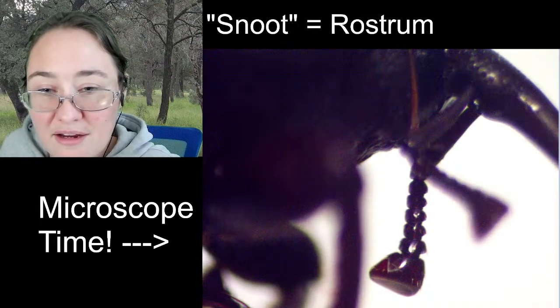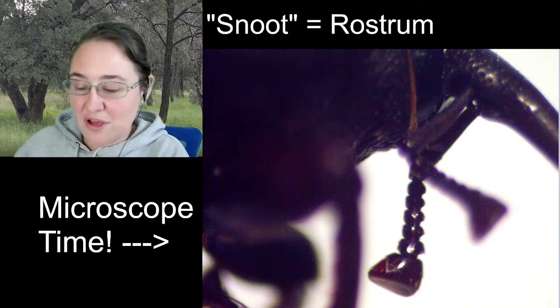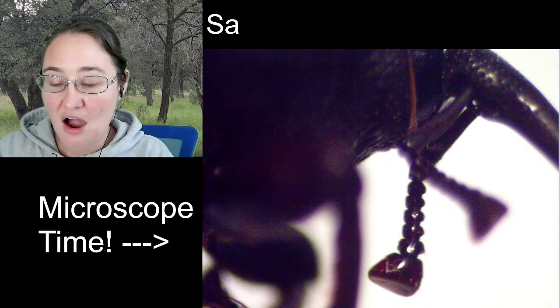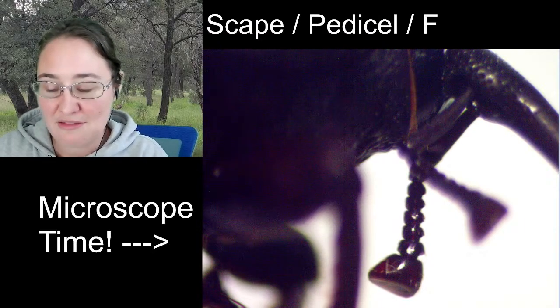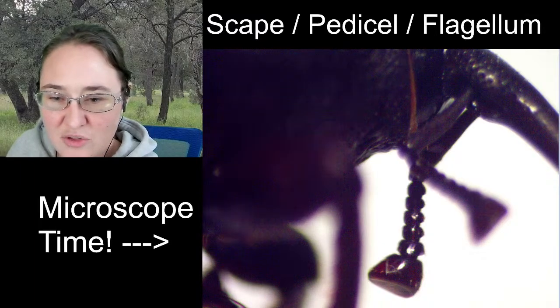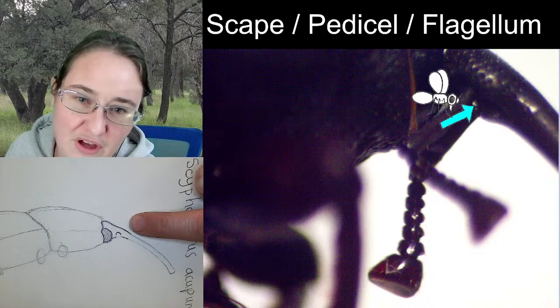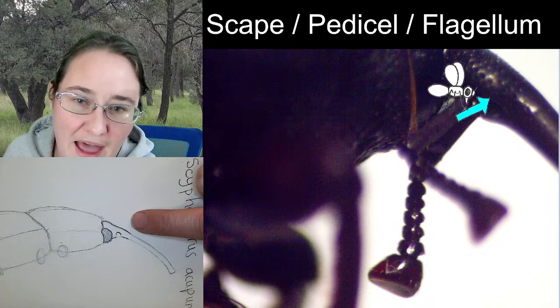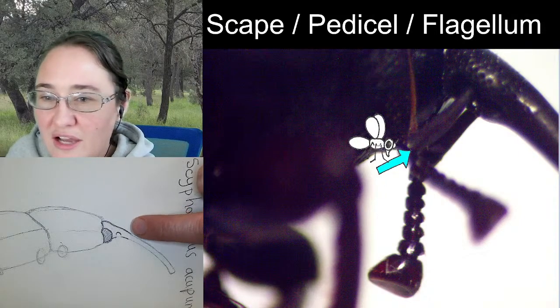There are 9 antennal segments on our antenna here. Now, many of you who have been here before will already know the segments of the antenna are the scape, the pedicel, and the flagellum. So the scape is going to be your first segment. It's this really nice long segment right here. It starts right here, the base, kind of in front of the compound eye, and then it goes all the way to right about here. It's one long segment to here, and that is the scape.